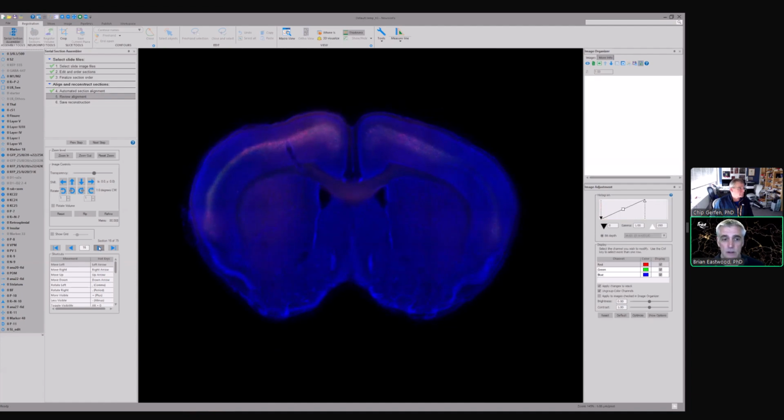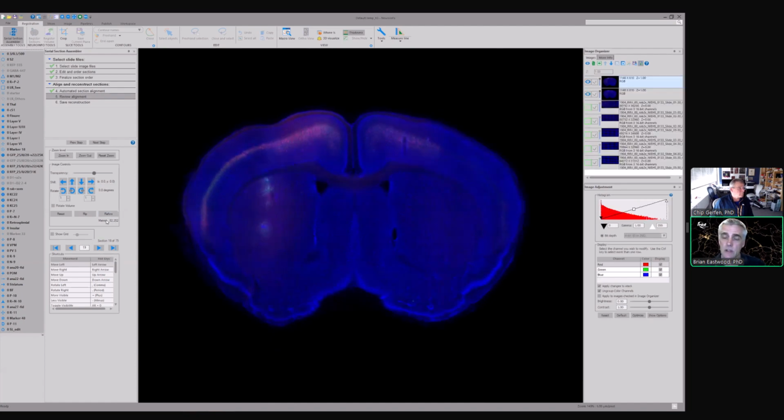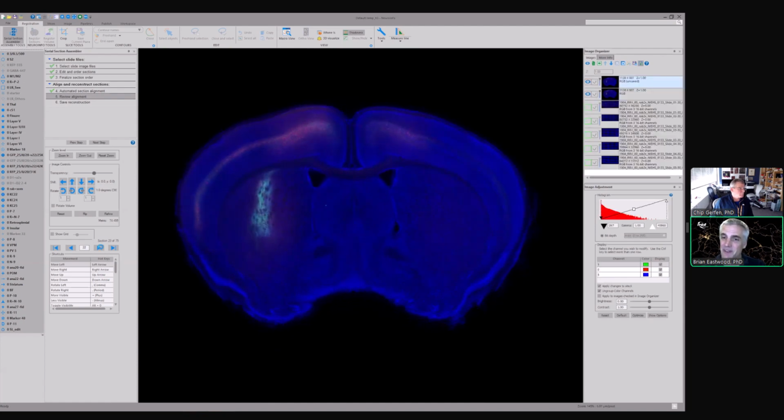The other thing you can do here, next to the flip button, there's a refine button. You can run another round of registration for the pair of images that you're looking at. And that'll just start with whatever the registration is that you have right now, whatever that transform is, and it'll just try to run another optimization from there. Sometimes that can be really useful if you have damaged tissue. You don't often have damaged tissue, but if you do, you can interactively line up the part of the brain that you want to be aligned, and then run refinement, and that'll snap those features into place.